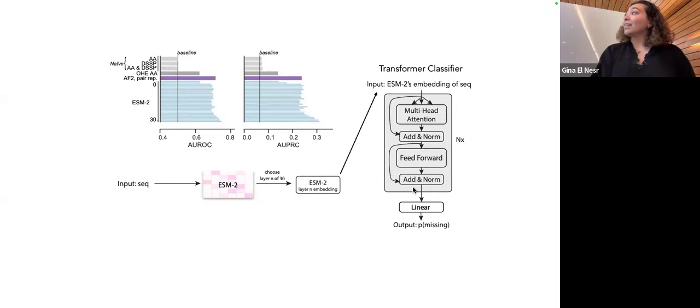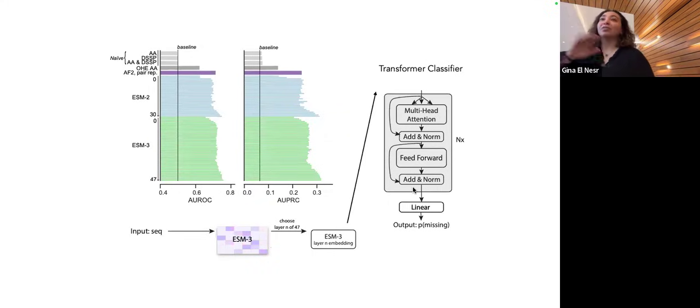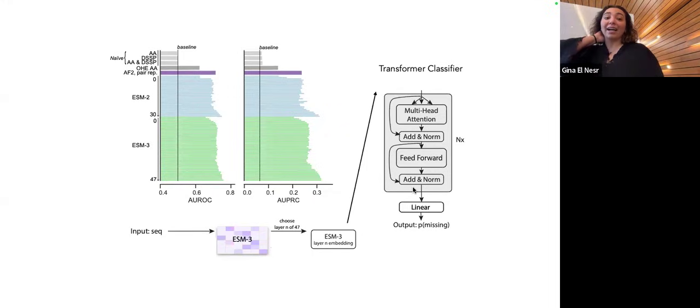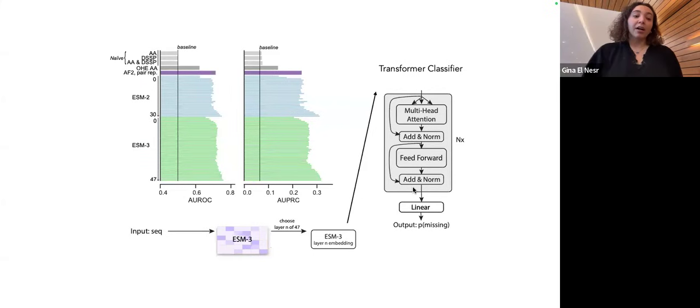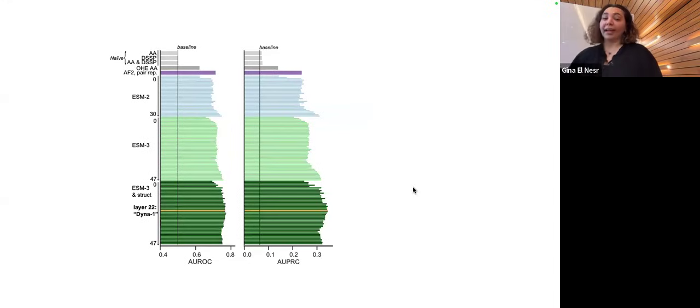And then I think I had finished this ESM2 task and then ESM3 had immediately shown up in a paper somewhere. And I said, hey, well, this one also has some structure information. So what if we do the best of both worlds? And so we took ESM3 and said, let's just establish this basic baseline of just sequence space and learn that. And it does actually outperform ESM2 a bit, and that's most likely due to the scaling laws. But then if you incorporate the sequence and the structural information of the protein of interest and train it that way, we see much more gained information.